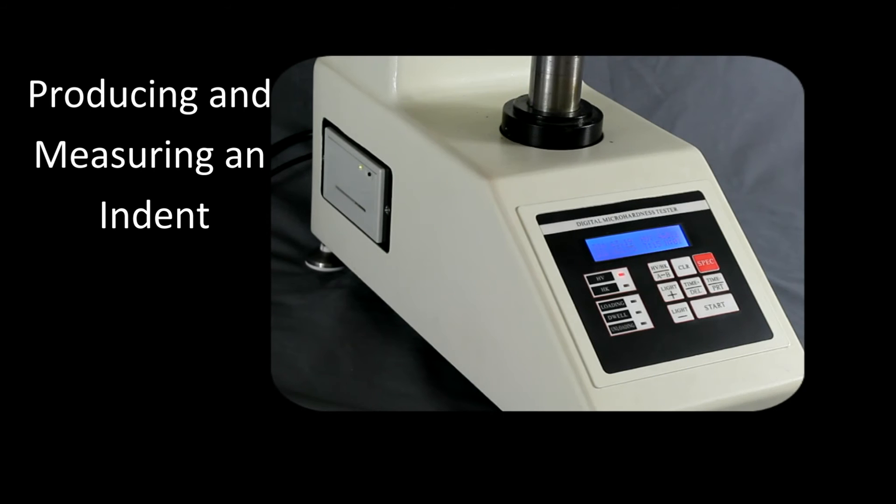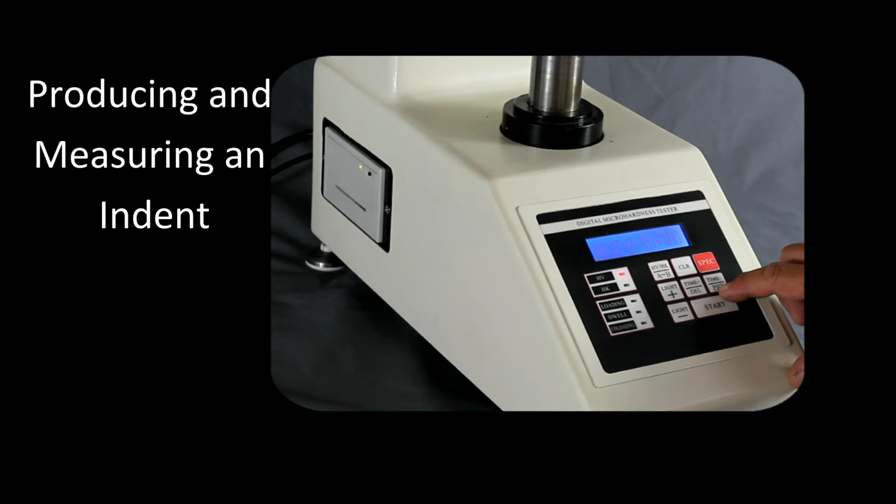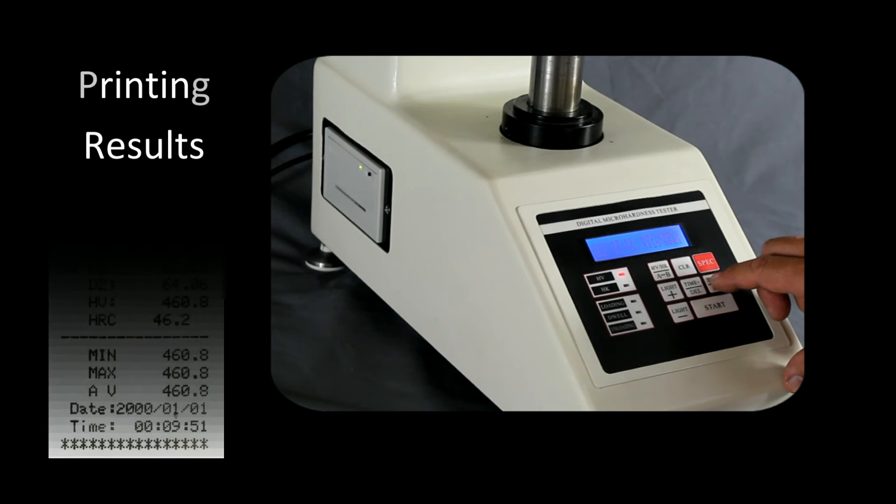After we complete the measurements, we can go ahead and print the results. To print, we go over to this key — on top it says time minus and below the line it says PRT. To access the PRT, remember we have to press the spec button first and then press PRT.